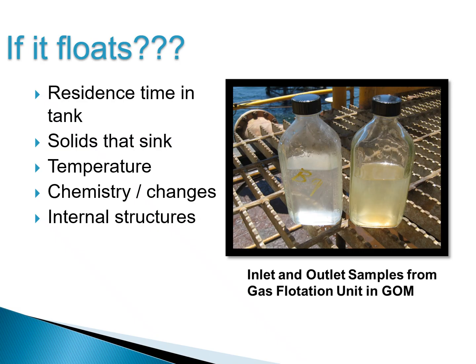There is no clear interface. There's no layer of oil at the top. This is a stable emulsion. That's oily water that will not be separated.